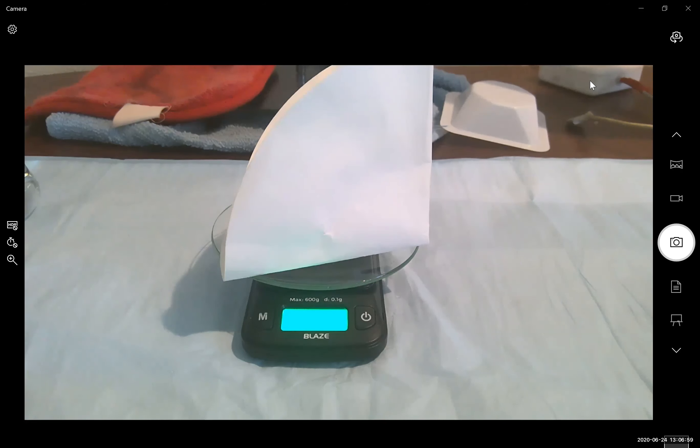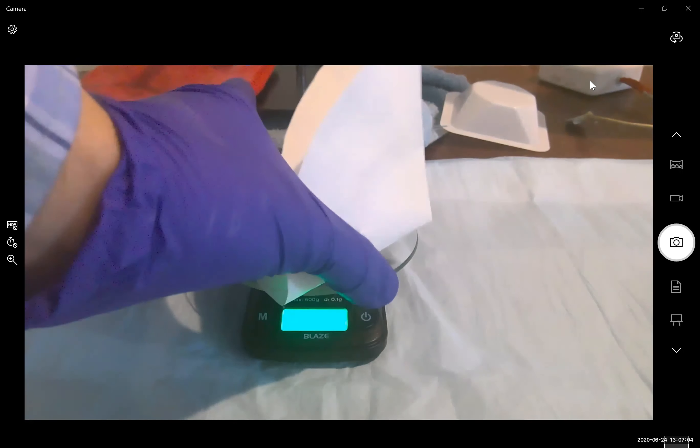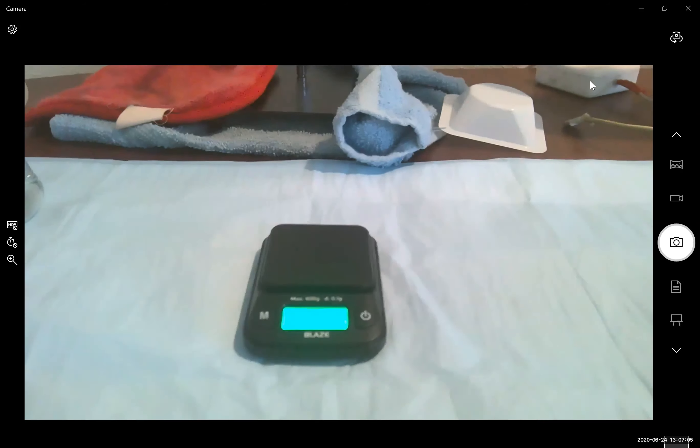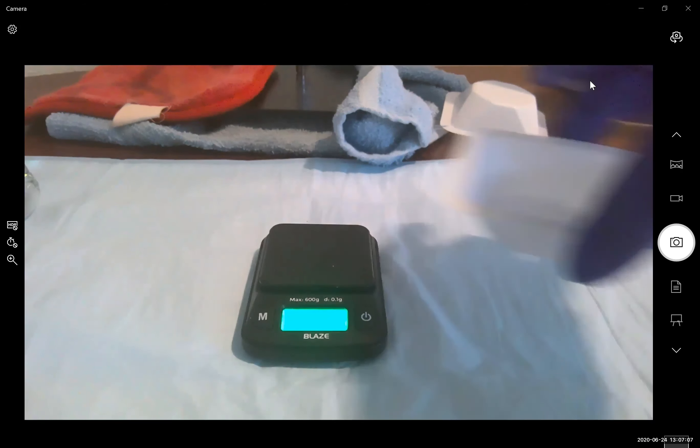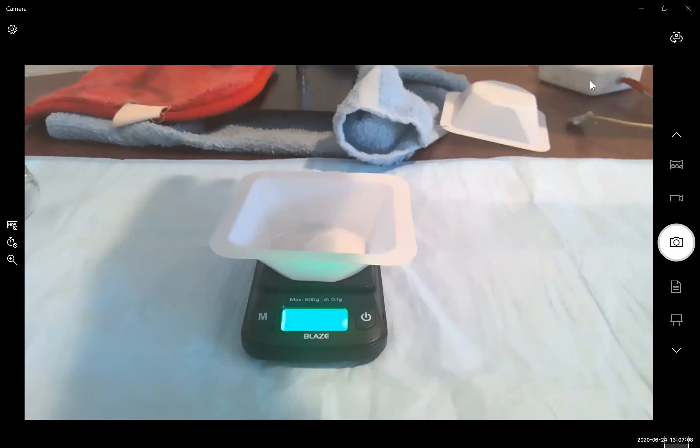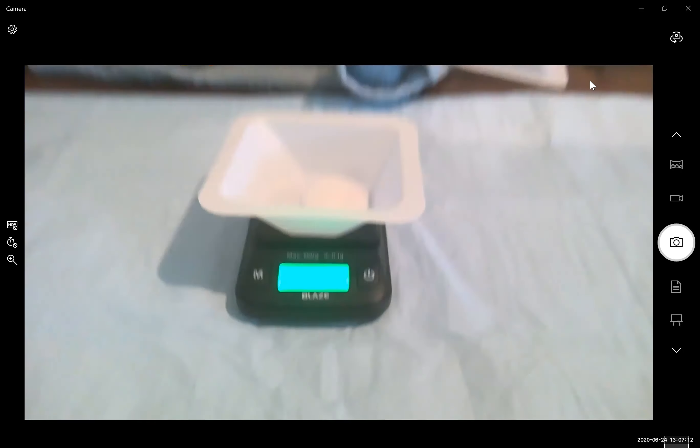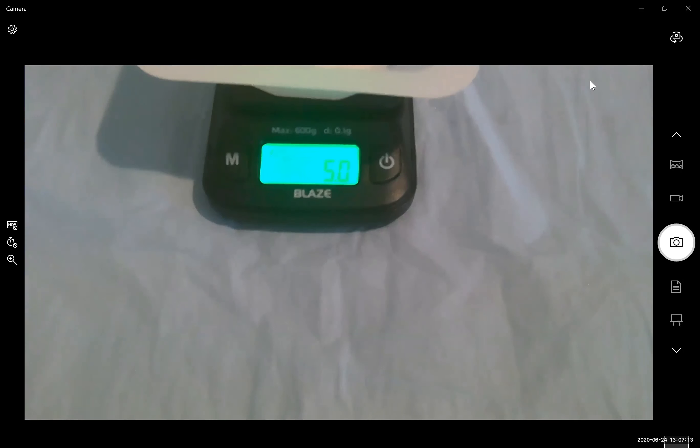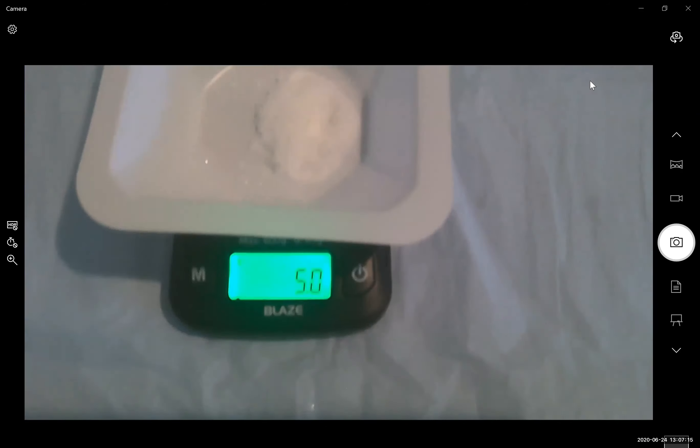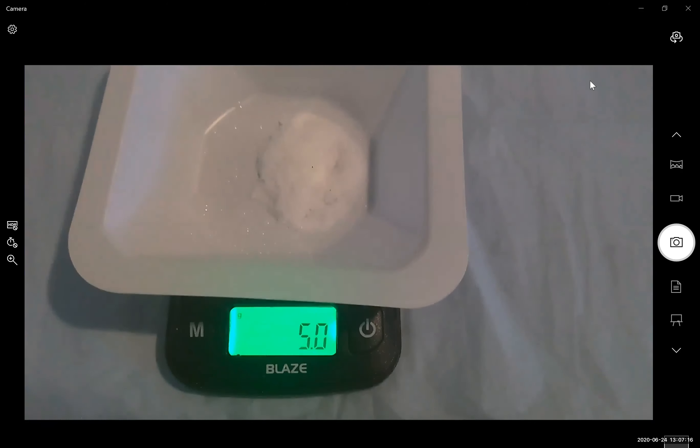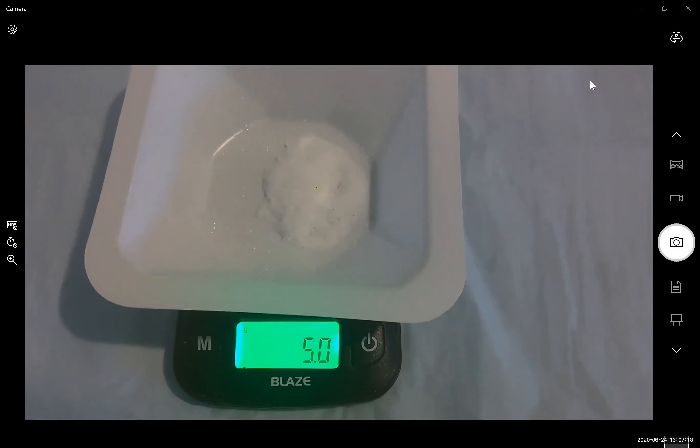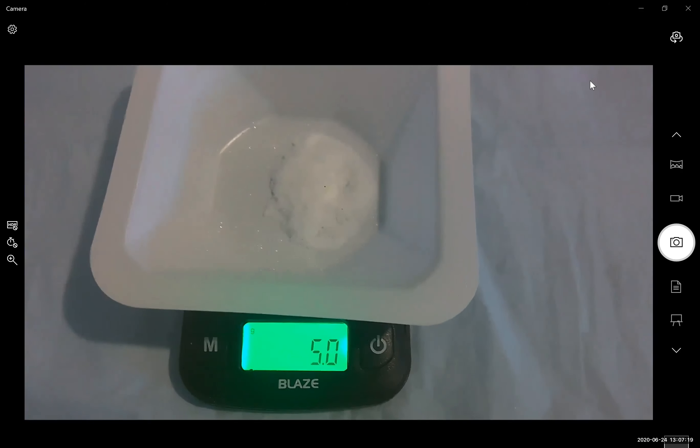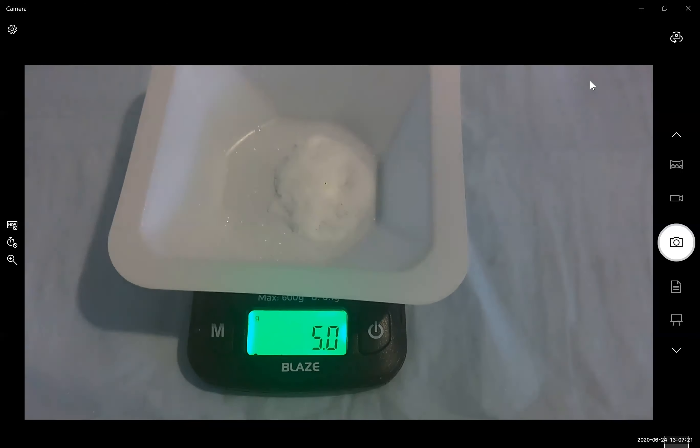Okay, perfect. So that concludes the mass of calcium chloride. Let's do one more recap of that. Here is our calcium chloride and water. This is the calcium chloride we let sit overnight, just to show that calcium chloride is pretty hygroscopic.